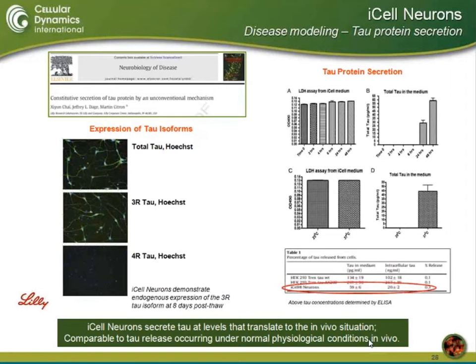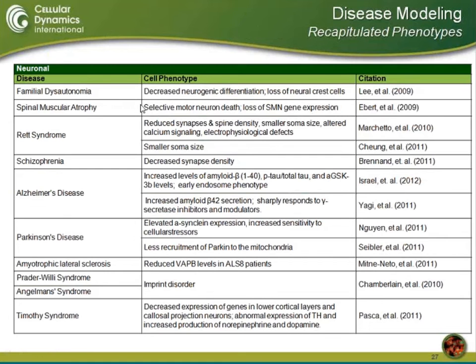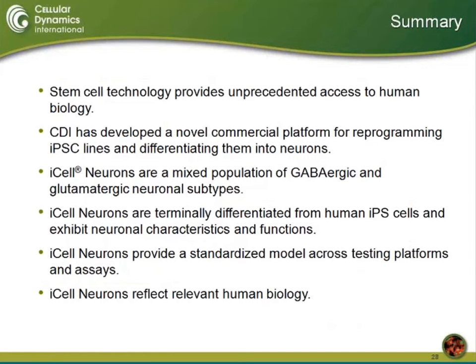And to further characterize the subtypes within our mixed population, we have some nice staining here just to show the presence of the VGAT and VGLUT. So we have the very nice punctate staining along the processes that shows we have the machinery to be there to show the functionality that we'll see later on, and the presence of those two subtypes of the GABAergic and the glutamatergic neurons here. And we also see that we're able to stain with GABA to highlight those specific subtypes, along with the general stain of MAP2.